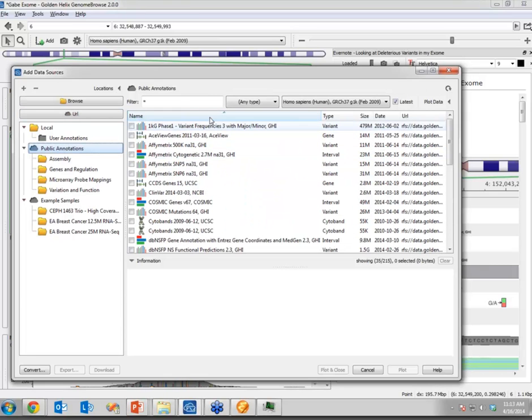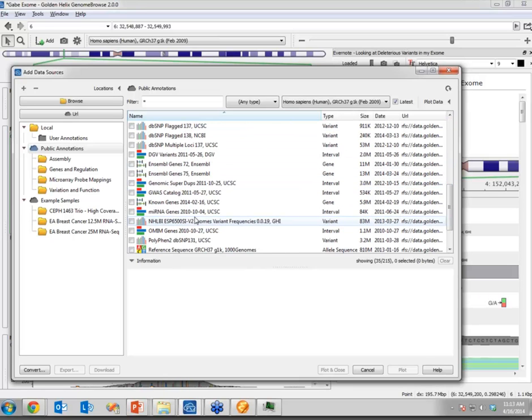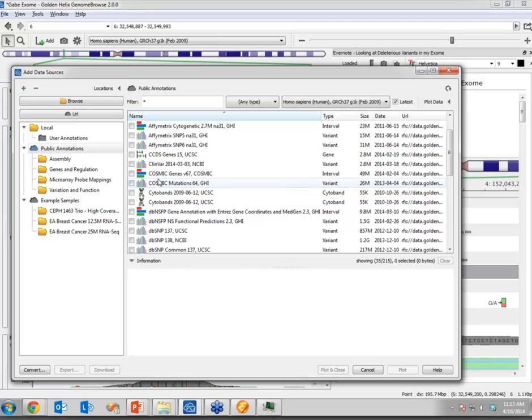were aligned to GRCh38. Compared to our current annotation repository for 37, where you'll see we have every version of dbSNP, all these functional predictions that you're going to use for classifying which variants are of high relevance, gene annotations, clinical annotations, ClinVar, all these things, and they really don't seem like they're in all that much of a hurry. So at the moment, there's no good reason to go there unless you're just exploring it, or you are essentially dealing with variations that are fundamentally structural, and you are fine being sort of on a desert island where you're making your own waves.